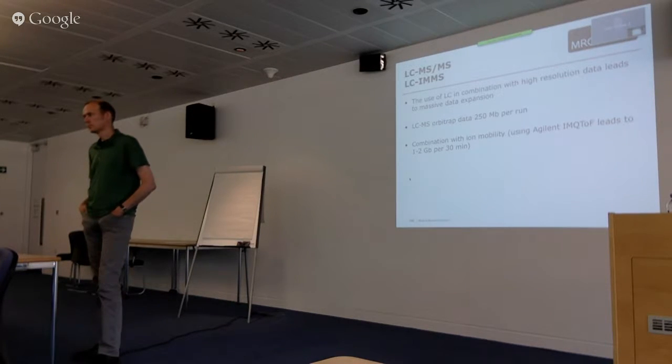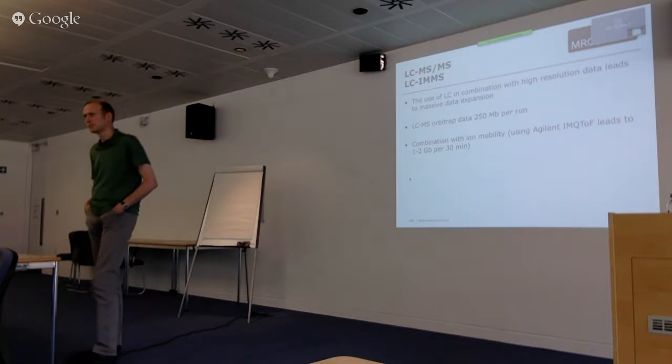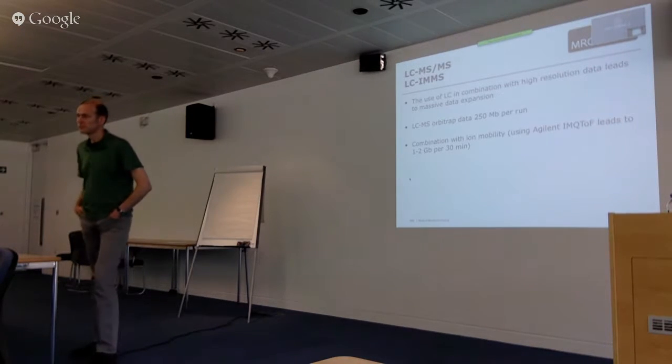How else do you define what noise is? Same with blanks. You don't see a blank sample from a method. People can report very small pieces, but everything increases the folder size. Then you ask for run order as well, because in the run order is where the blank is, and where the QC happens. So it's always extra information. I think also the technology is at such a stage that you can't avoid that. You have to be able to interpret the data.